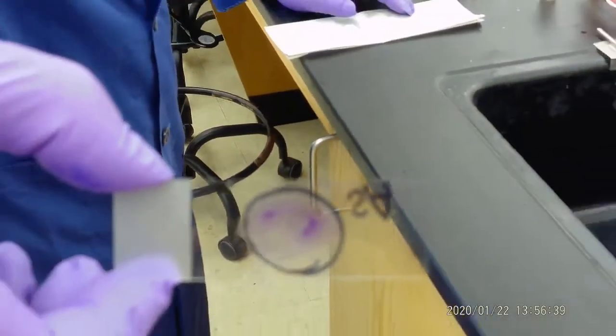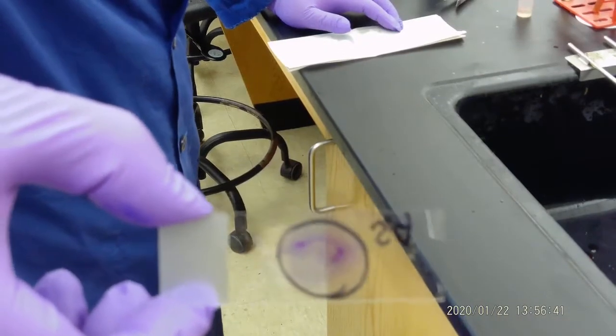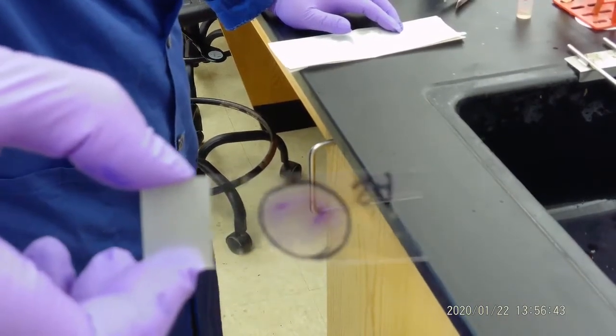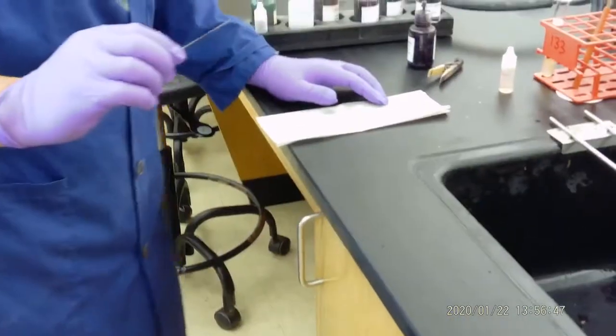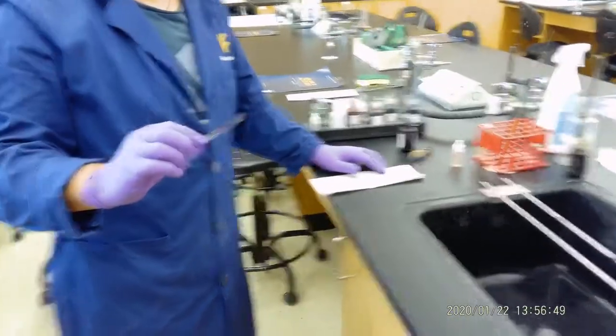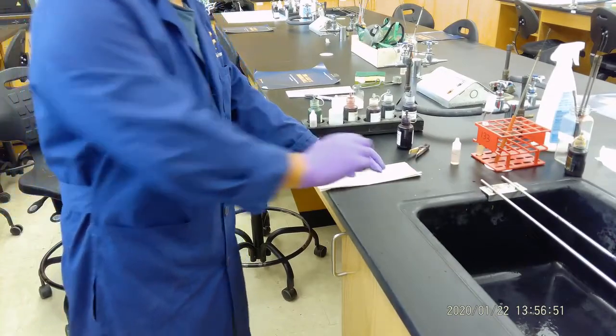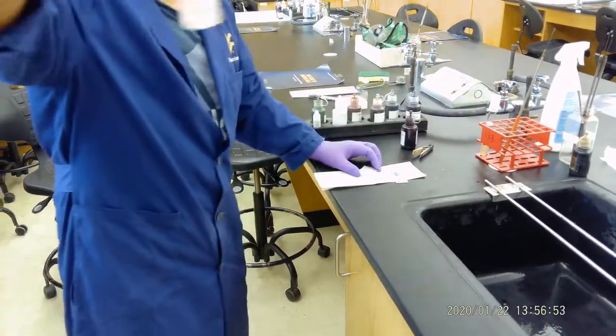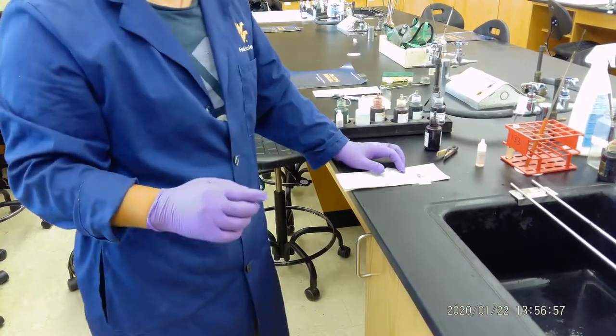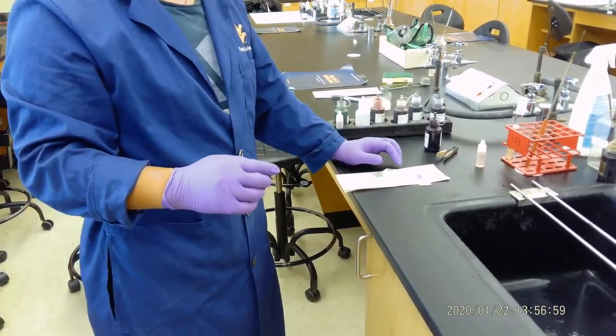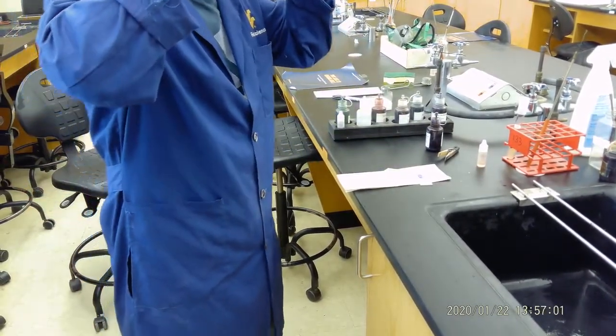Now, for simple stain, we want to see the shape, morphology of the bacteria and the arrangement. So this glass slide, we will do the observation under 10x and use oil immersion. Using the oil immersion, we will do further observation under 100x. That's all I have for the simple stain.